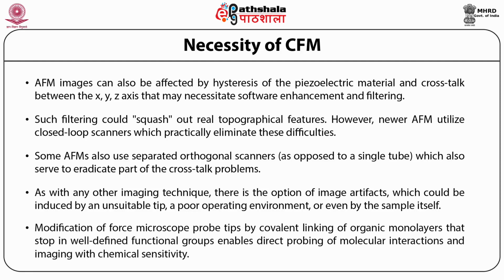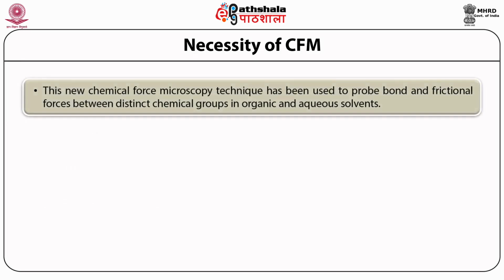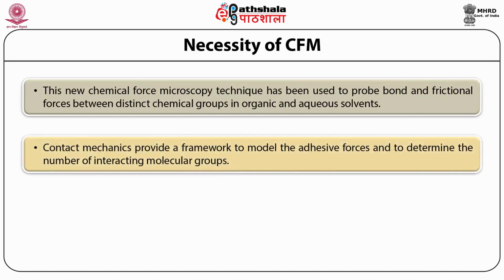Modifying the tips by covalent linking of organic monolayers that terminate in well-defined functional groups enables direct probing of molecular interactions and imaging with chemical sensitivity. This chemical force microscopy has been used to probe bond and frictional forces between distinct chemical groups in organic and aqueous solvents.